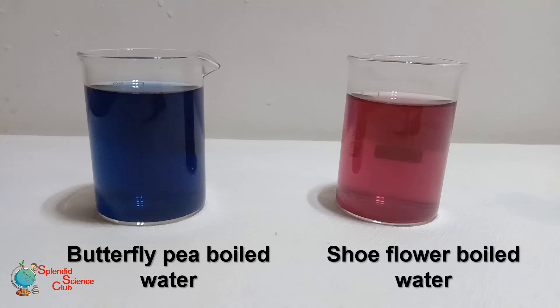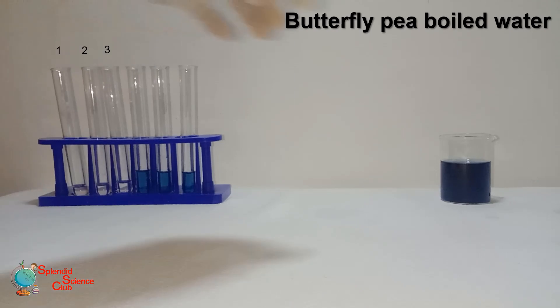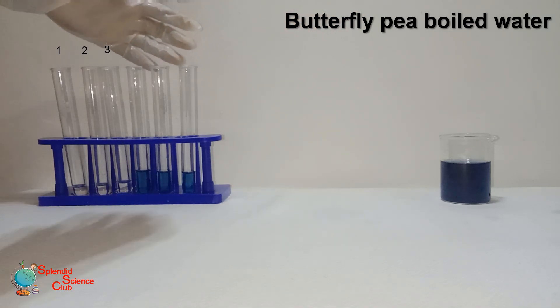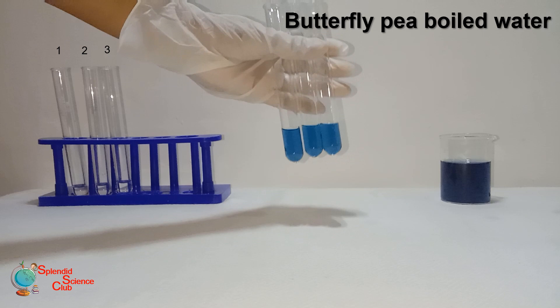Do you know what a natural indicator is? It's a solution prepared with natural substances like leaves, flowers, or fruits, and it can be used to identify whether a substance is an acid or a base. This is butterfly pea flowers boiled water — we have put the same amount of it into three test tubes.